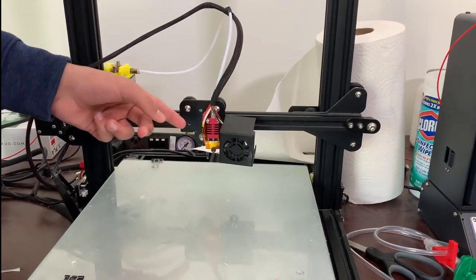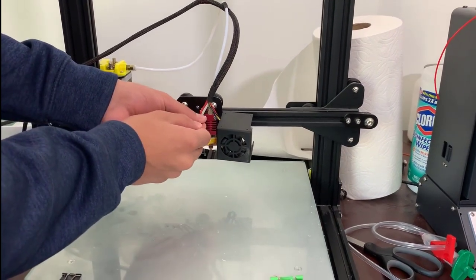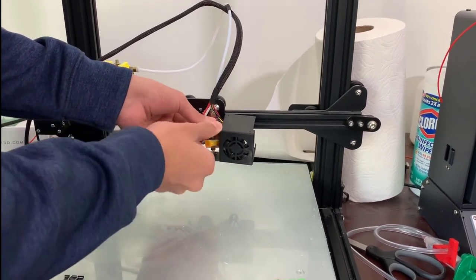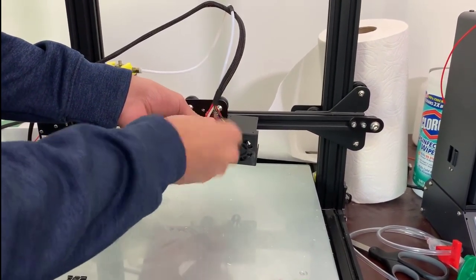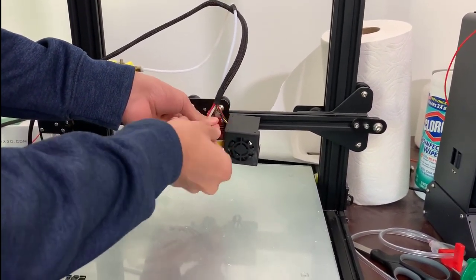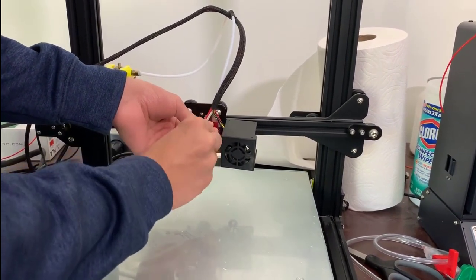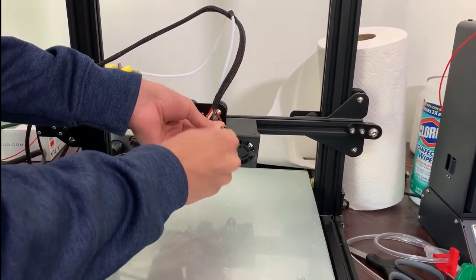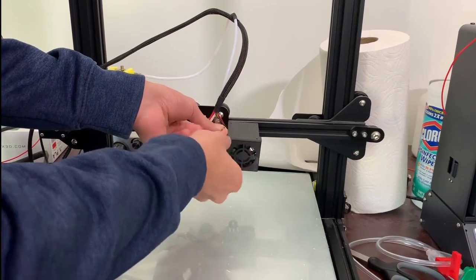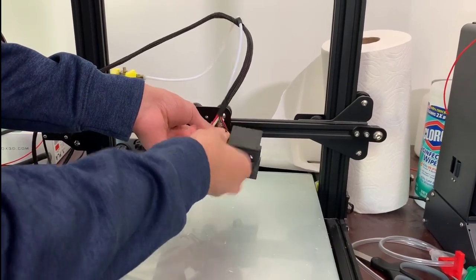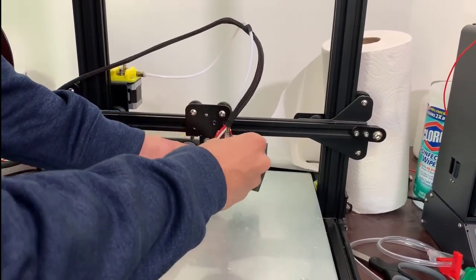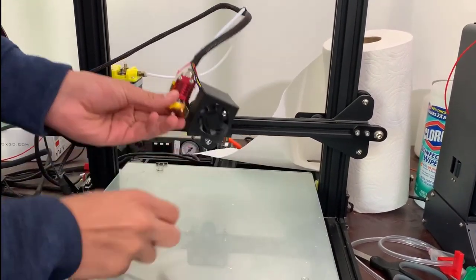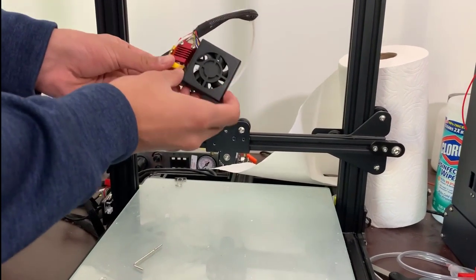So the first step is going to be removing the extruder and the casing that surrounds the extruder. So as you can see, I'm using an Allen wrench to remove the actual extruder from the 3D printer. We need to remove the extruder because we are going to be placing our syringe based system in place of the actual extruder.